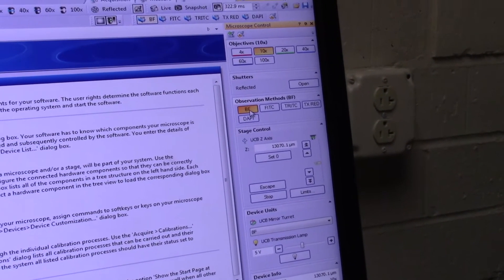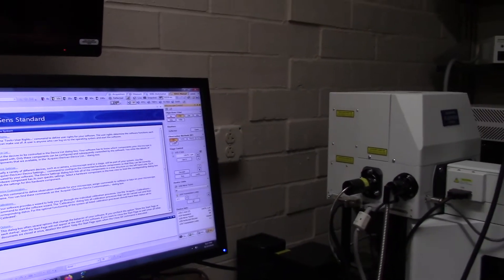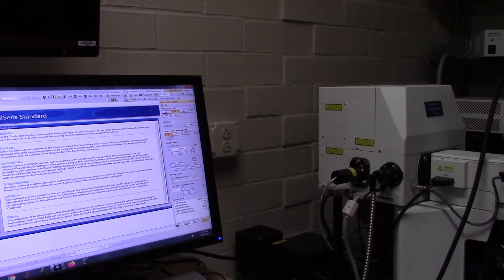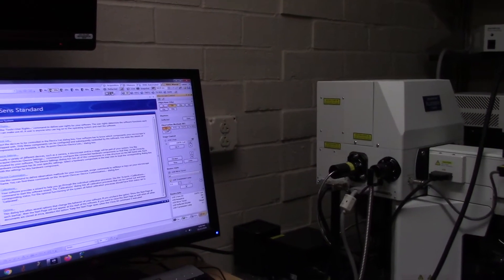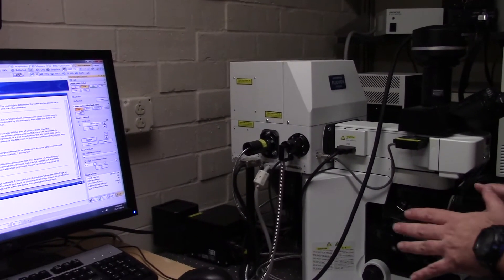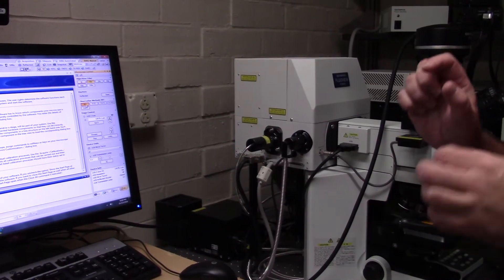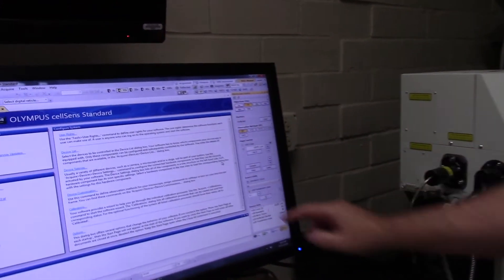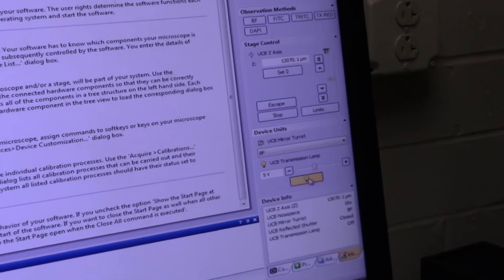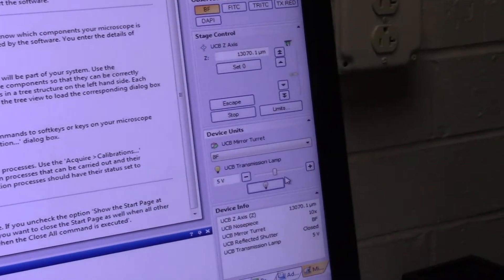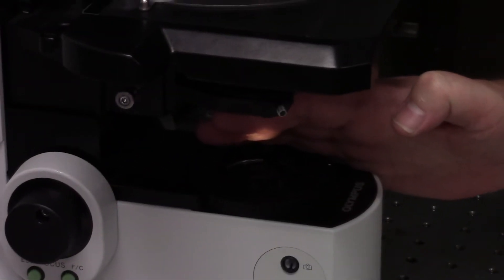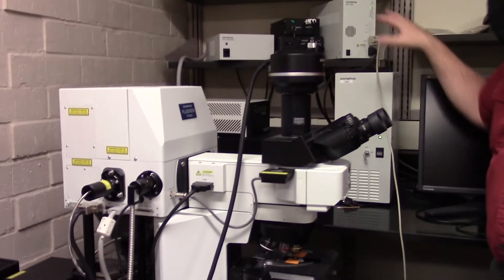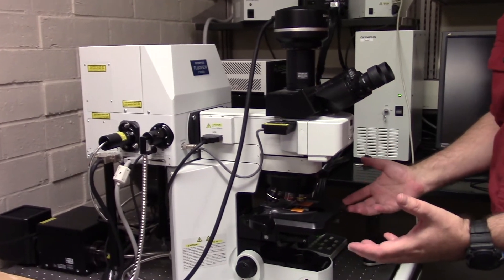Bright field is actual white light, just like the light in the room, just like the light on any normal microscope. We're going to use bright field to make sure our tissue is in focus on the stage, before we start looking for faint fluorescent signals. Down here we can turn on and off the lamp. I've just turned it on, and notice that when I put my hand under there, that light has been turned on. So we have proper control via the computer, via the universal control box, and all the parts of the microscope are currently working.